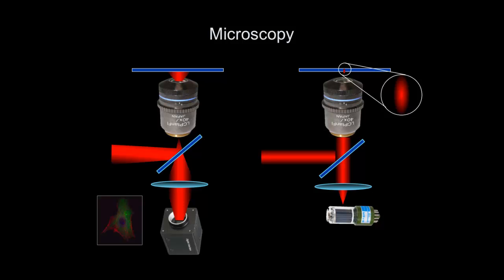And so the width here is about 0.3 microns or so, and the length here, the depth of this focus, is on the order of a micron. So that's what these high numerical aperture lenses do. They create these beautiful focal spots. They either operate in this condition, which is a wide field imaging operation mode, or in this focused mode, but the resolution is the same between the two. The resolution is just defined by this lens.